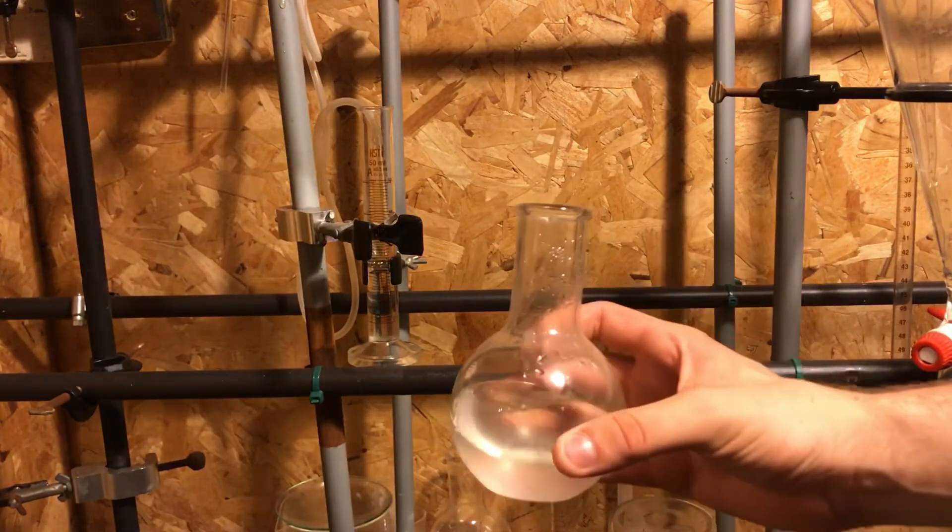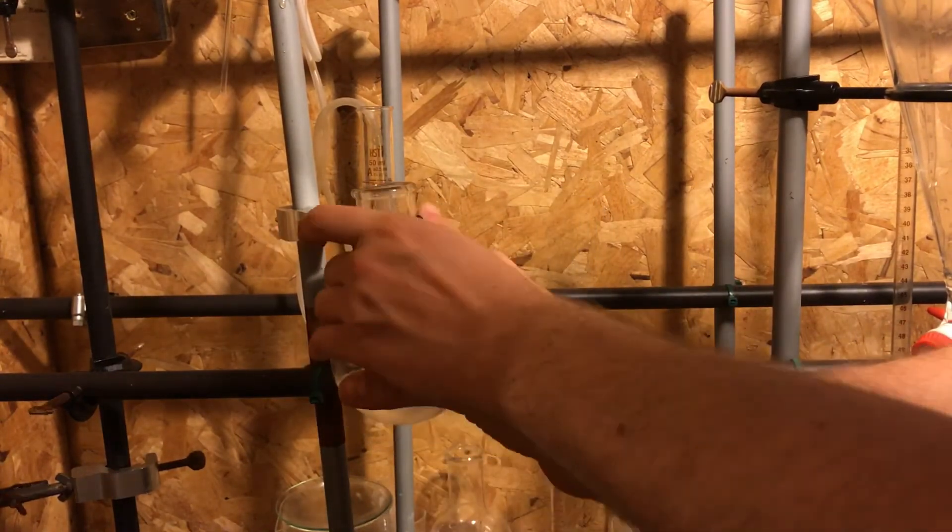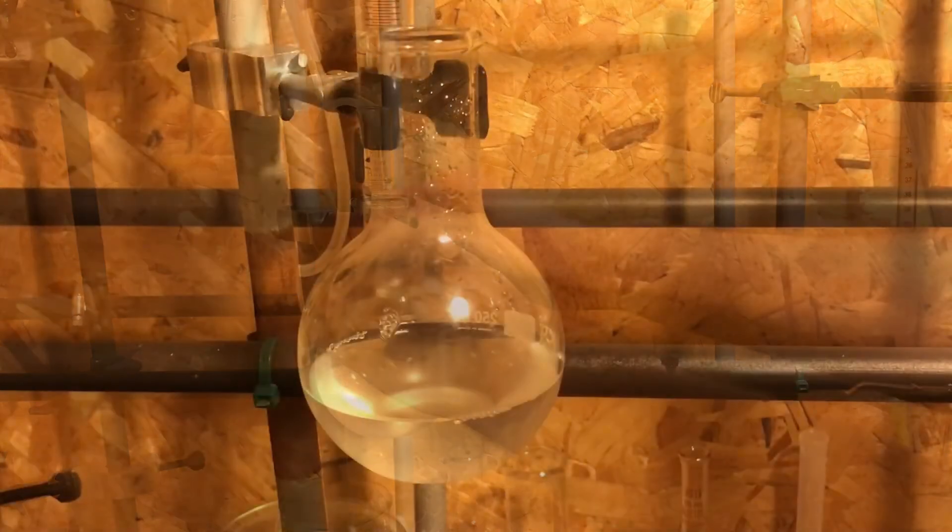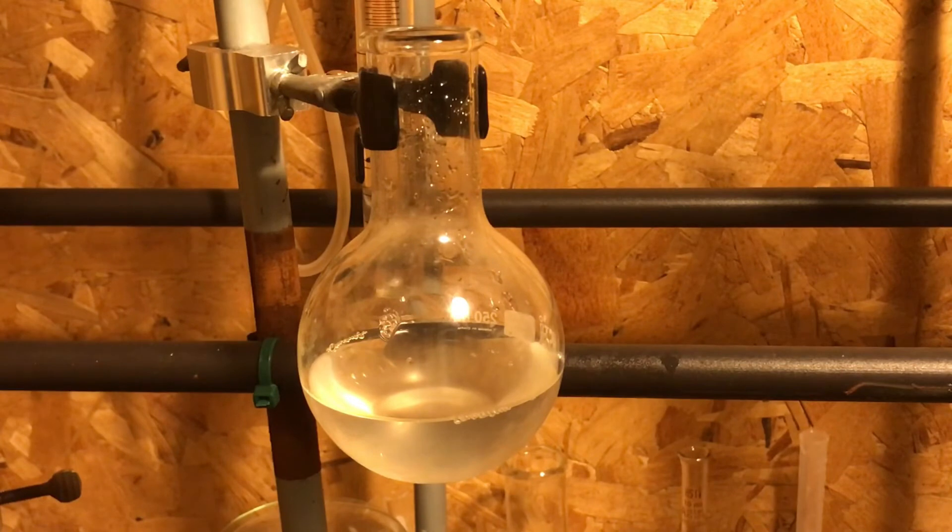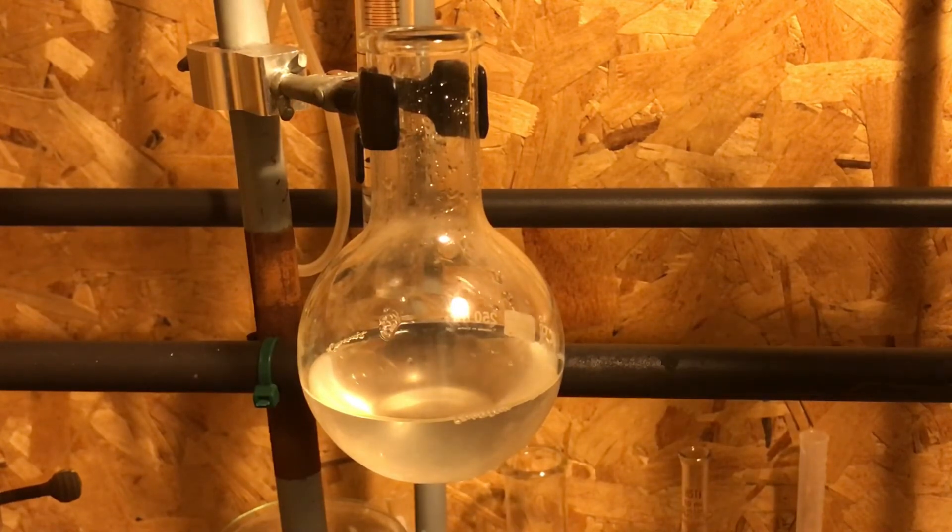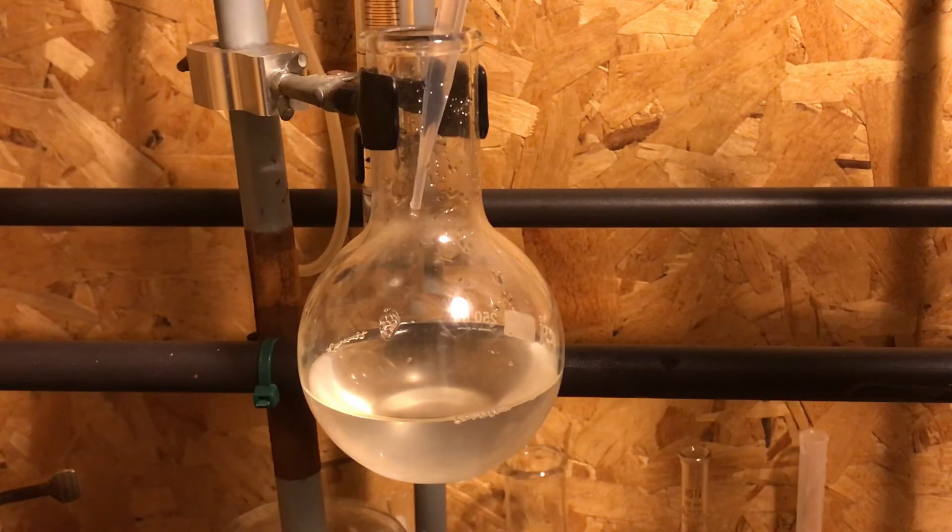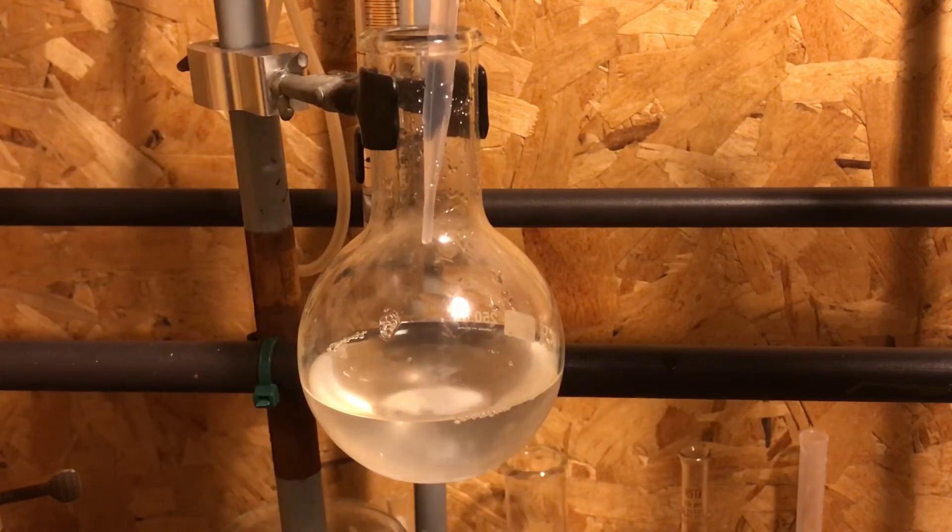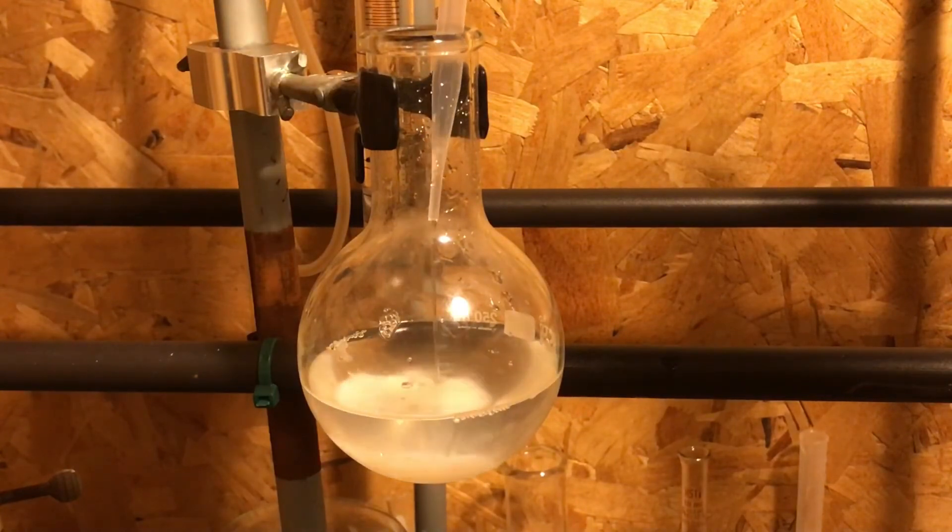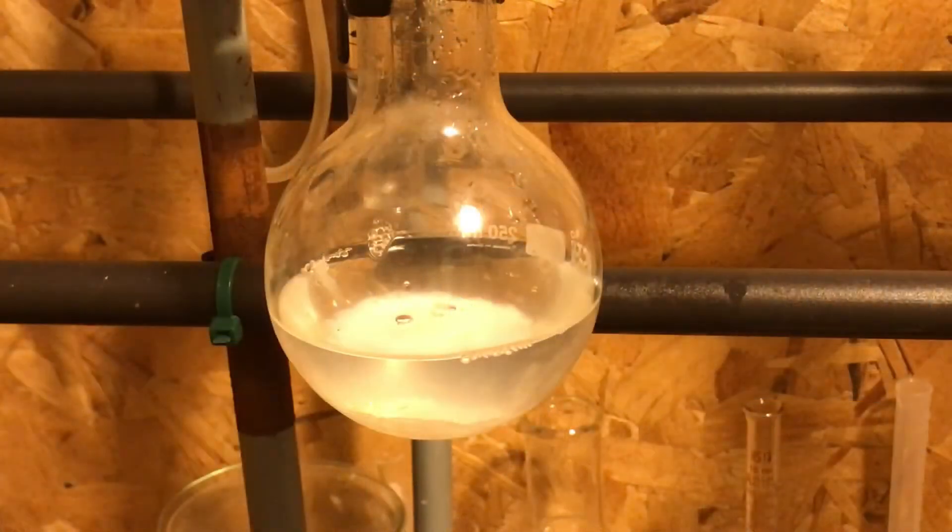Okay. So in this round bottom flask is calcium acetate. So we have the solution of calcium acetate. I'm going to very carefully drop in potassium hydroxide, potassium hydroxide, KOH, to the solution. And you should immediately see the formation of calcium hydroxide form.